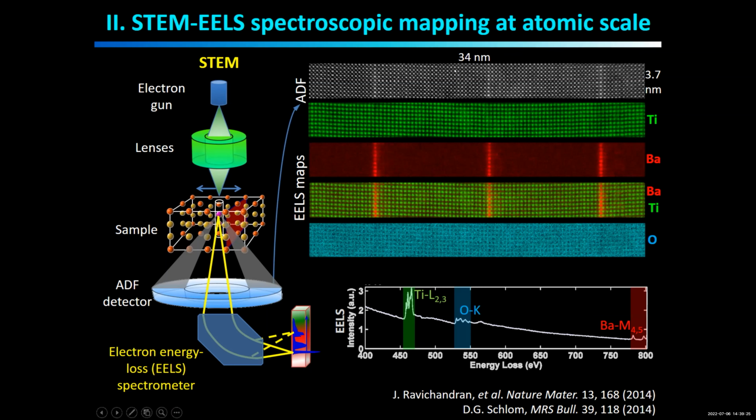Oh no, this is a bulk material. We are just looking at the cross section. In cross section, this is a cross section of the bulk material. So it doesn't need to be very thin, right? No, well, it cannot be too thick. It's better to be less than 50 nanometer, but 50 nanometer is still reasonable thickness. So you can only focus on a specific layer, right?